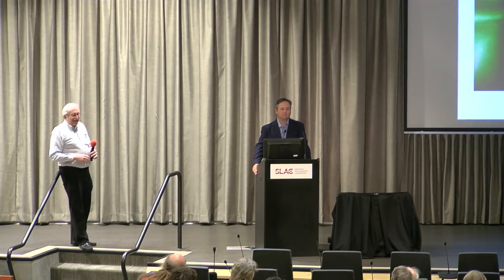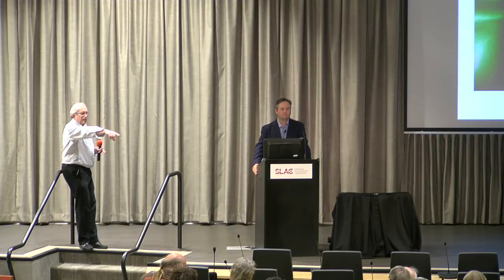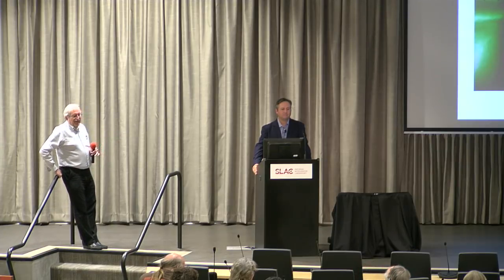Greg. Use your microphone. From what you explained about the damage, how will it work for multi-bunches in LCLS2? Because the first bunch will destroy the sample. The second sample won't have anything to look at. Right, that is a very good question.